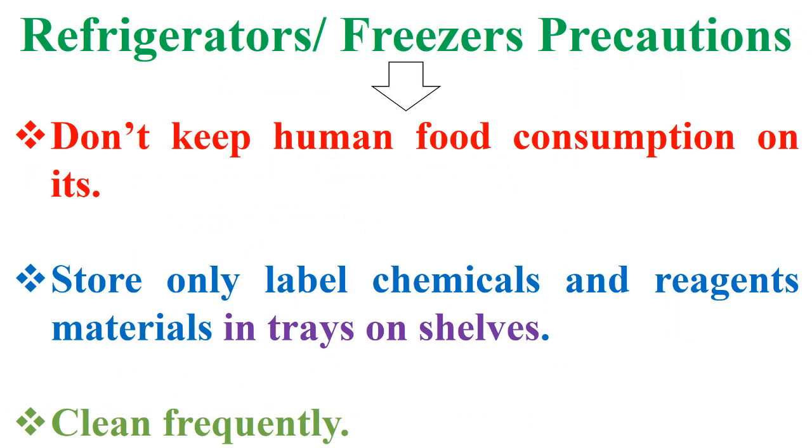So, while working with laboratory refrigerators or freezers, don't keep human food on them, and store only labeled chemicals and reagent materials in trays on shelves, and do clean frequently.